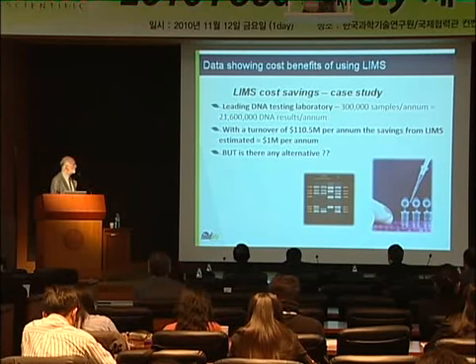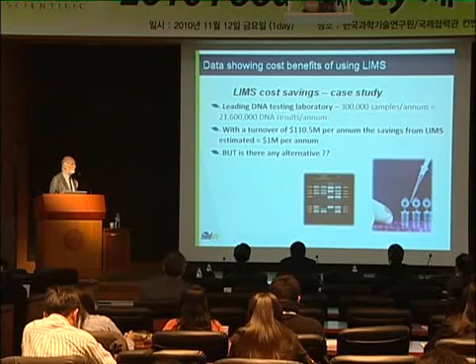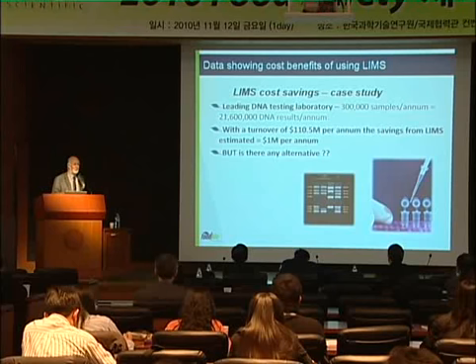And this lab had a turnover of 110 million New Zealand dollars each year, and the saving moving from manual manipulation of data to LIMS resulted in $1 million saving each year. I don't know what the investment cost is, but it's very easy to see the business case for a LIMS system, because it's not difficult to make savings like this, which are not insubstantial.